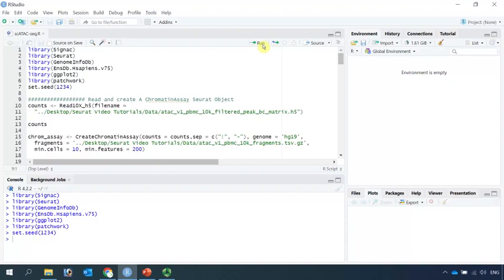Now, we are ready to read the data into R. First, let's read the count matrix data into R. This is a H5 file. We can use the Read10X_H5 function.